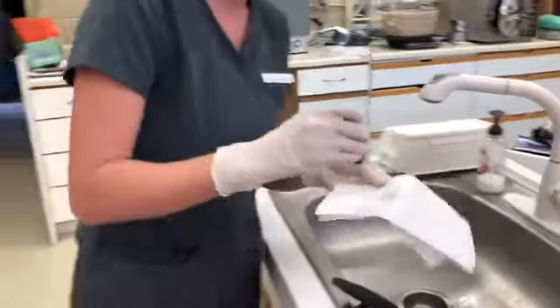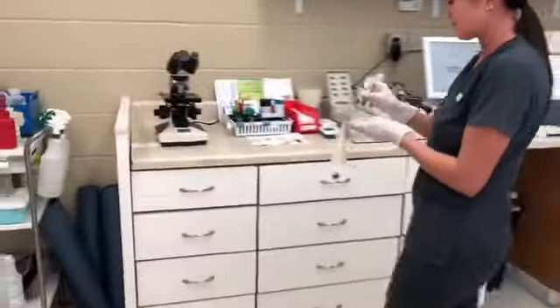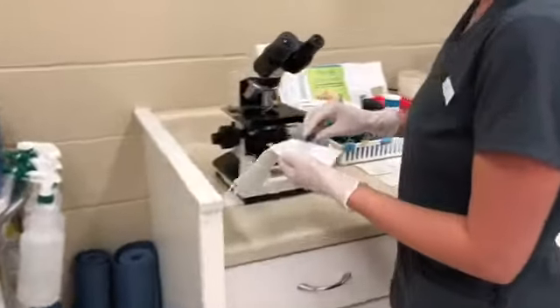I'll get that excess stain off with the distilled water. Perfect, so I'll bring it on over to the microscope. We do want to make sure it's nice and dry so we can take a look at it. We're going to examine this under 10x, 40x, and 100x power.